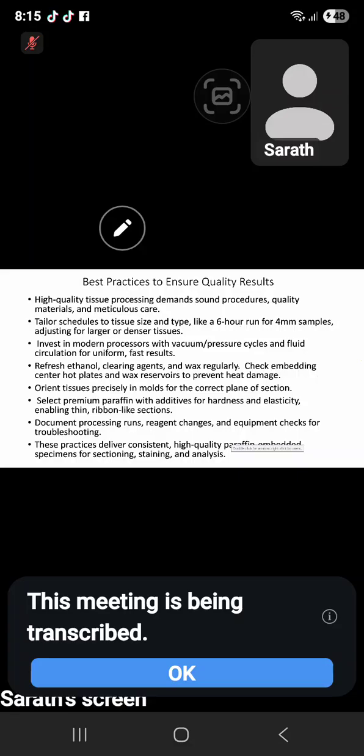Then tailor schedules to tissue size and type. According to the size and type of tissue, the schedule can be changed, like a 6-hour run for 4 millimeter samples, adjusting for larger or denser tissue. Like that, you can adjust the run: 6-hour run, 8-hour run, 10-hour run. The time period can be adjusted according to the type of tissue you are using.